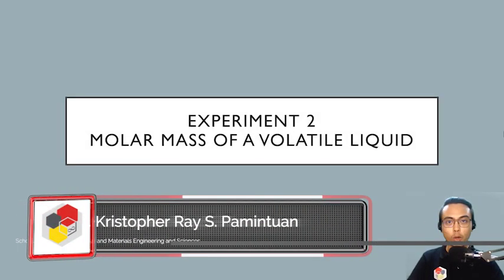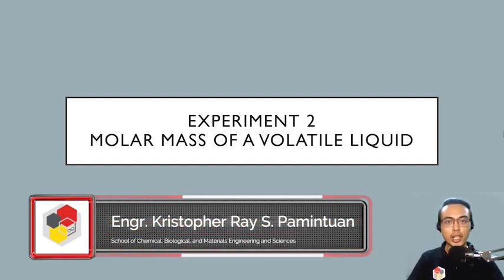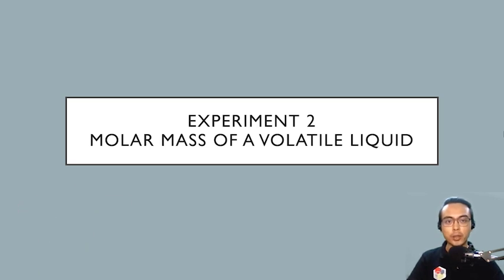Good day everyone and welcome to our next experiment. In this video, we will be demonstrating how to determine the molecular weight of a volatile liquid. So let's begin with some background.